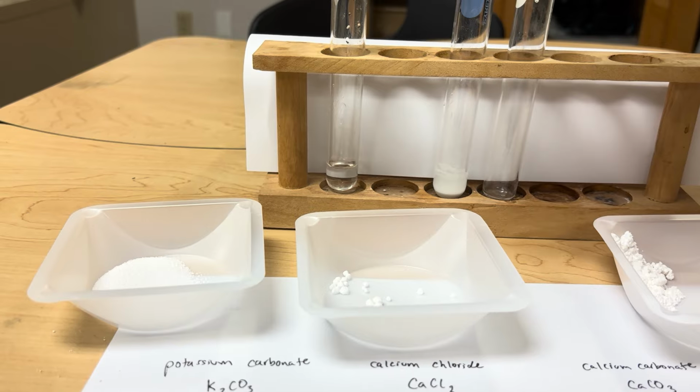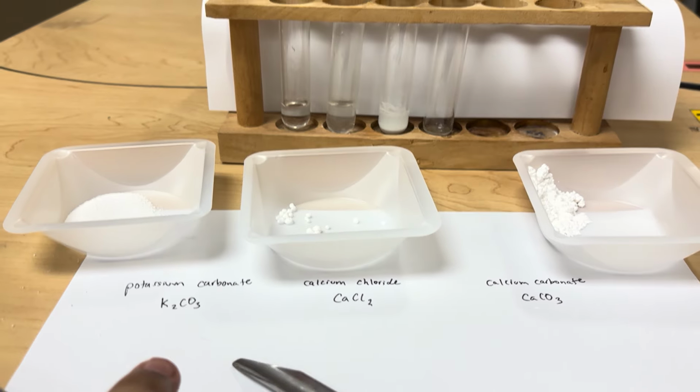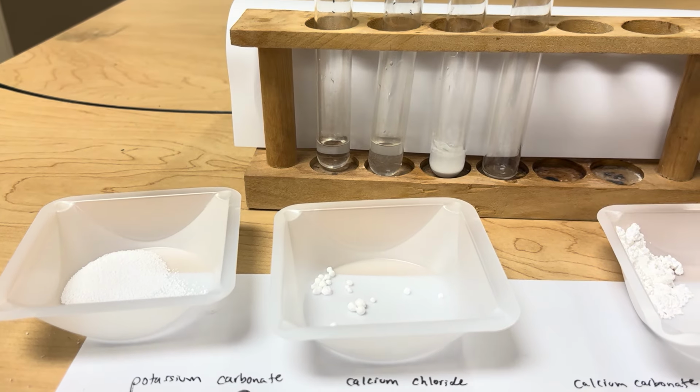So that's interesting, because my two ionic compounds containing calcium are less soluble, I guess, than the potassium one. I think it probably does have something to do with the calcium, because I don't think it's the carbonate. Look, my carbonate is in my potassium carbonate and that dissolved really easily.